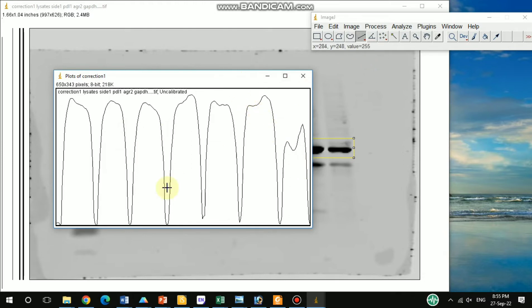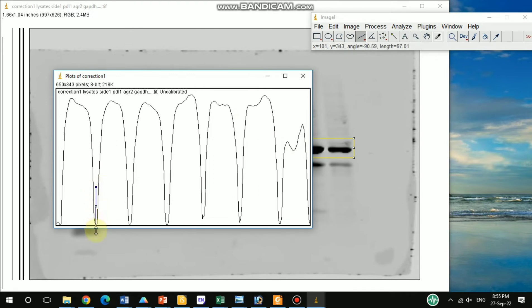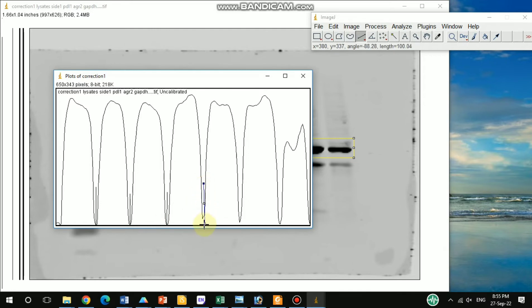There is a straight line option that is already selected by default. Using this straight line tool, you need to separate all of the peaks. You need to touch this line at the base, at the end of each peak. By this way, you need to separate all of the peaks — it should already be separated.